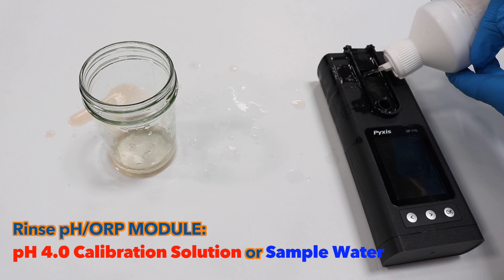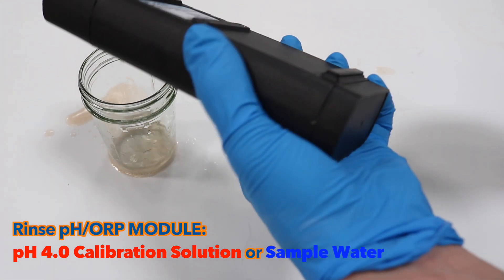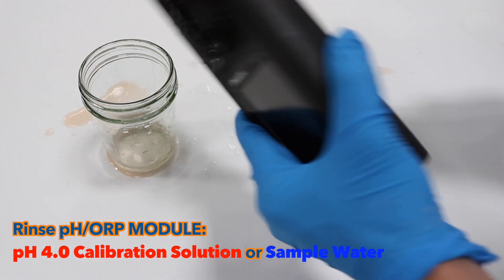Then rinse the PHORP module with PH4 Calibration Solution or sample water. Do not rinse with DI water.